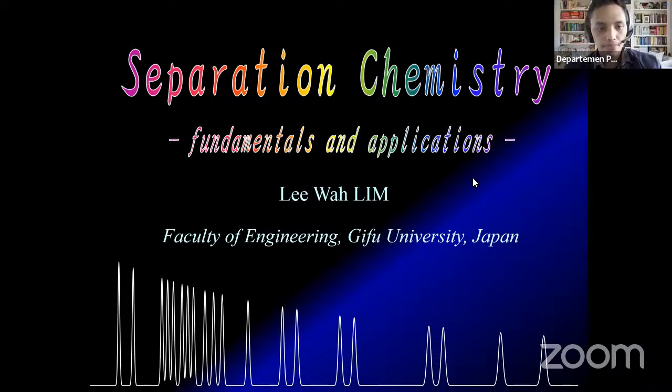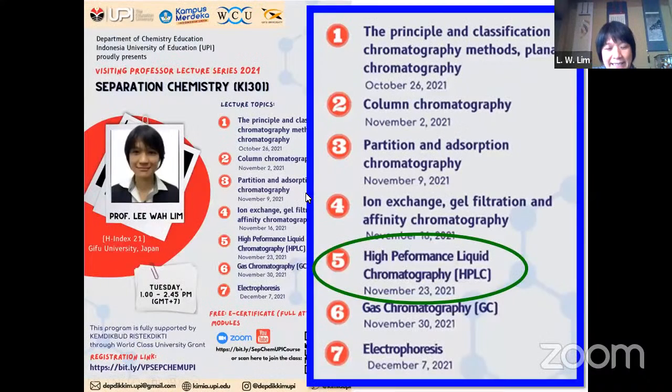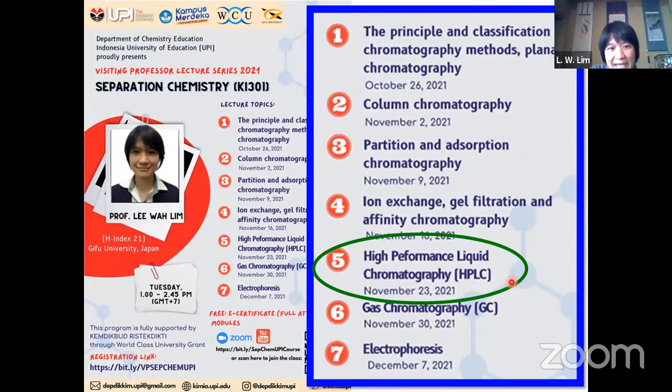Please. Okay. Good afternoon, ladies and gentlemen. Thank you for joining today's class. So again, today's schedule is about HPLC. Maybe you have heard of the word HPLC many times.